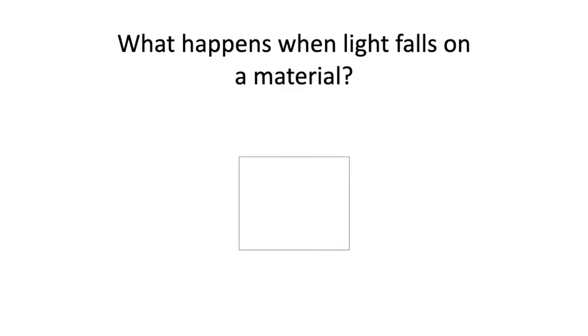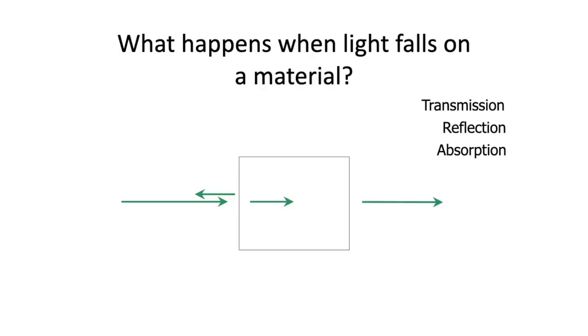So when I talk about light-matter interactions, from your knowledge, you know that the major things which happen are either transmission, then reflection, and then absorption, and luminescence, which covers fluorescence and phosphorescence. So these are the major things that happen in light-matter interactions.